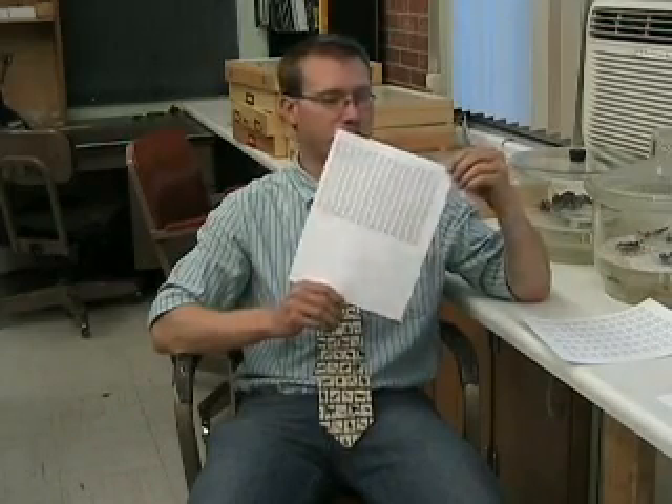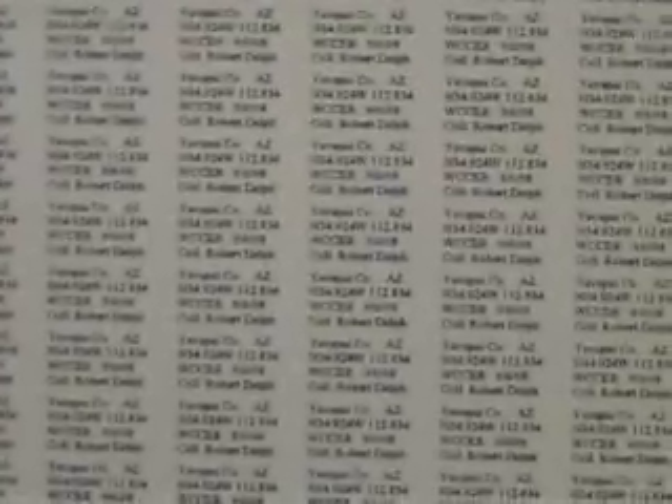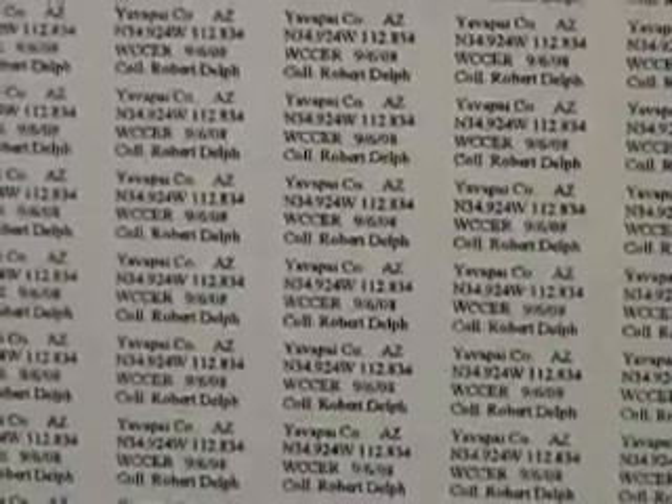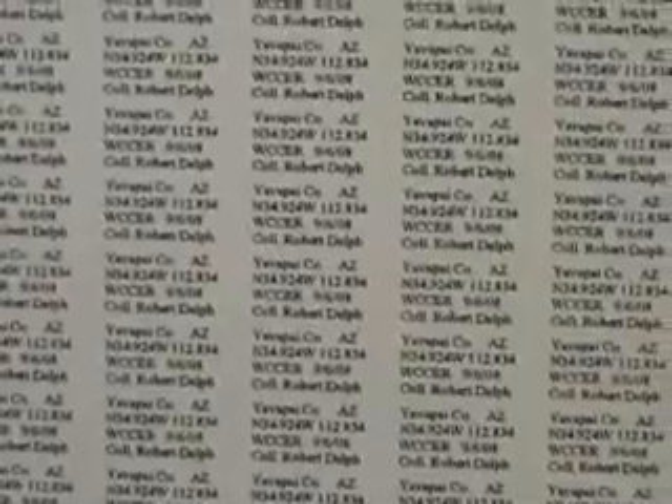You make labels for both pin specimens and for specimens in ethanol. What we use is acid-free, lignin-free paper — 65-pound paper that's acid-free and lignin-free. We use a simple laser jet printer to make this. The font is pretty small; what you want to use for pin specimens is 3.5 font. You can make this through Microsoft Word or Microsoft Excel to get your labels to the size you want.